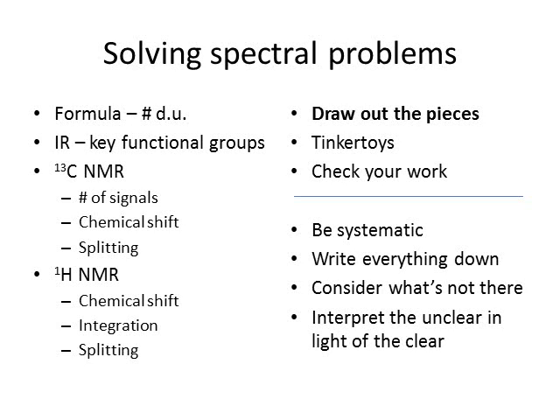And really, the least clear stuff is almost always going to be the splitting patterns, the complex splitting patterns in proton NMR. So do those last if you have to, because oftentimes you don't have to get there. Oftentimes it's obvious once you've looked at all the other things, so you don't actually have to interpret all the information. That's something else I should have thrown in here.